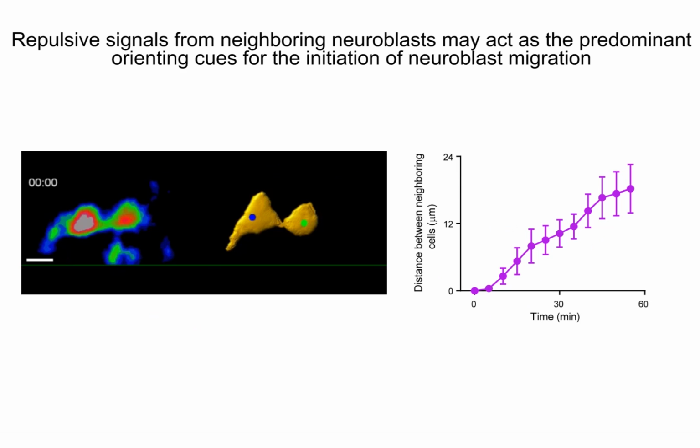So here is the quantification. Along the time points, their distance starts to increase. Before I move to the next slide, I want to show you the whole picture of this movie so you can appreciate how dynamic the interaction is.